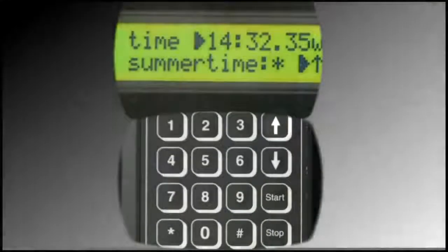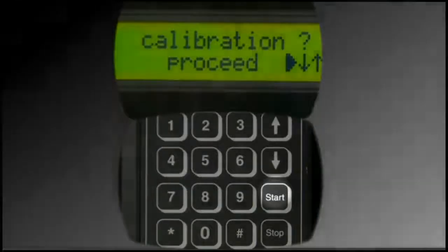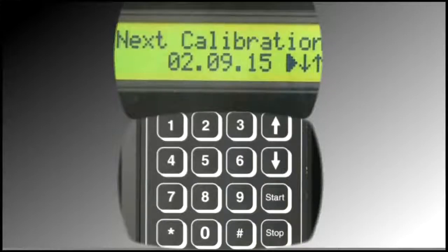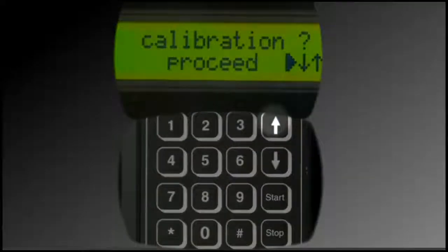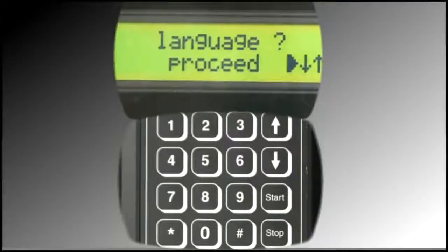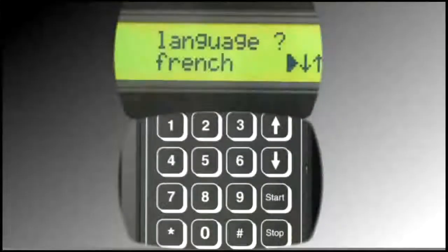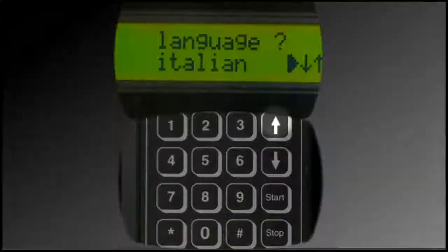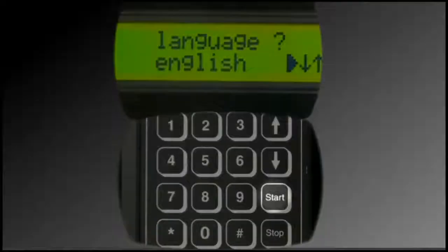Press the up arrow twice. Calibration displays. Press Start. The next scheduled calibration date displays. Press Stop. Press the up arrow. Language displays. Press the Start button. Press the up or down arrow to scroll through available language choices. When the desired language displays, press Start.